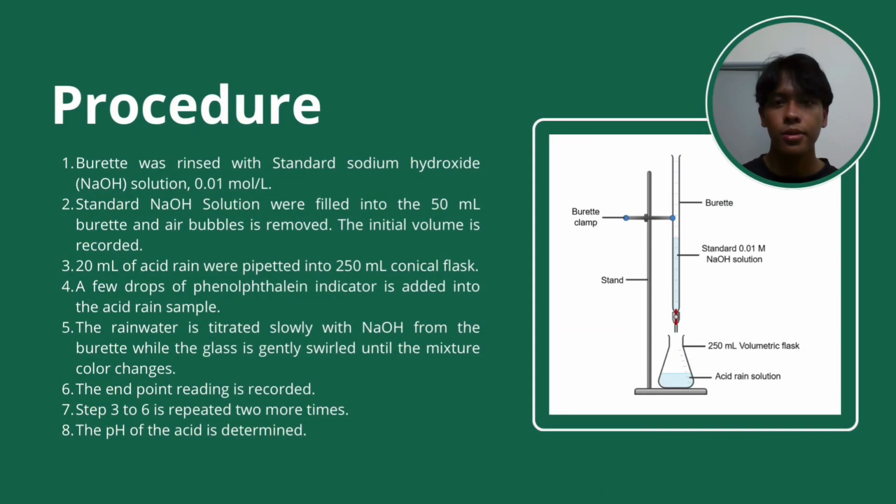Next, we will go through the procedure of this experiment. First, the burette was rinsed with standard sodium hydroxide solution of 0.01 mol per liter molarity, and then the standard sodium hydroxide solution was filled into the 50 ml burette and air bubbles were removed.